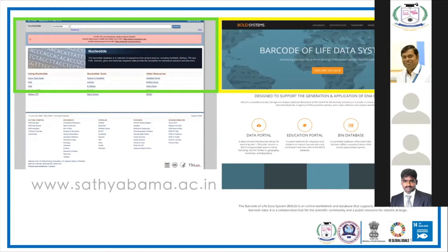And another thing is, these are all very important. At the same time, whenever we do the DNA sequencing, sometimes we get good results, sometimes we don't. Many sequencing errors may occur. In that case, this platform won't accept the sequence. They will suggest we run it once again. So it is a very difficult process in the BOLD system, but they are very standard.